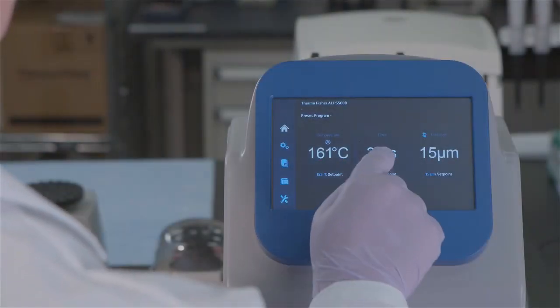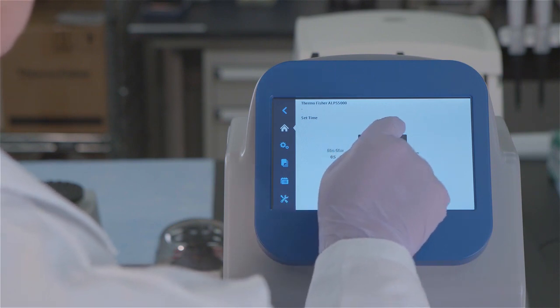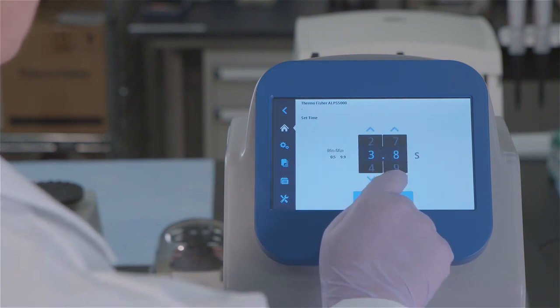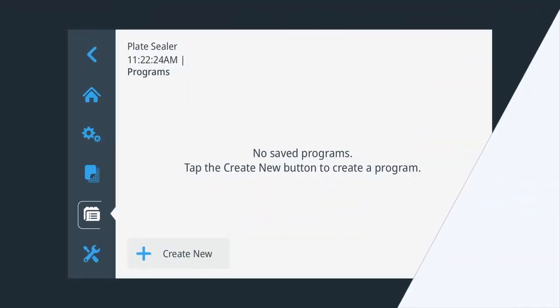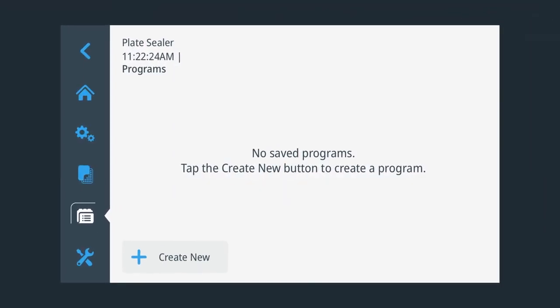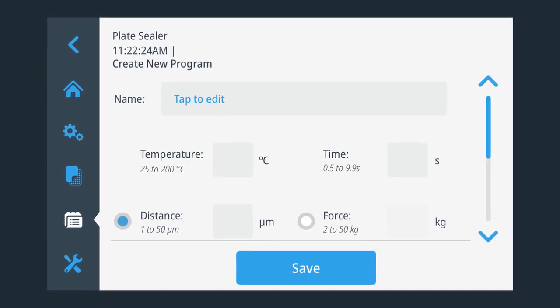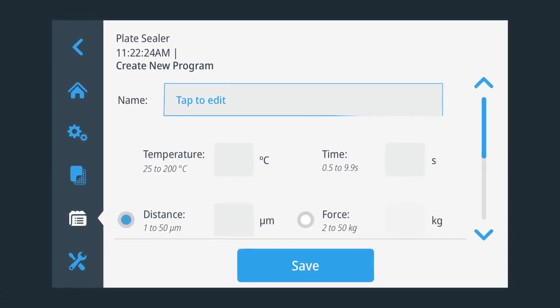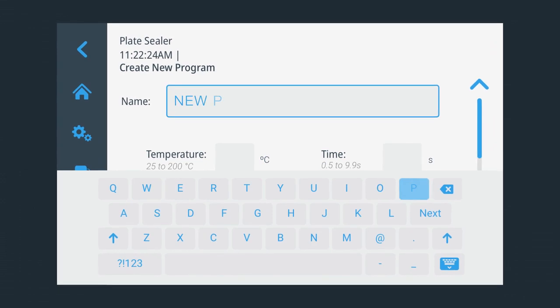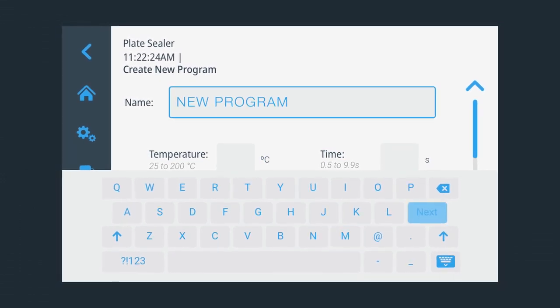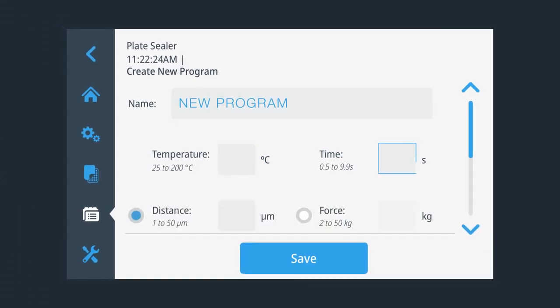The ALPS 5000 automated plate sealer offers ways to customize the sealing process and optimize performance. You can even save frequently used programs. To create a new program, tap create new on the touch screen. Tap the name field and enter the name of your new program. Enter the temperature and time from within the range specified on screen.